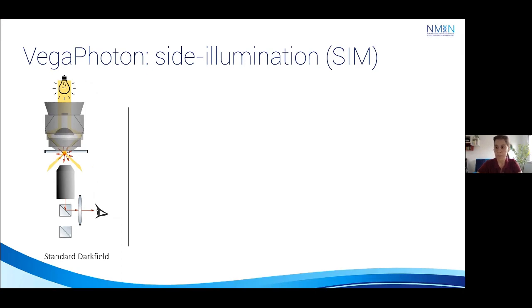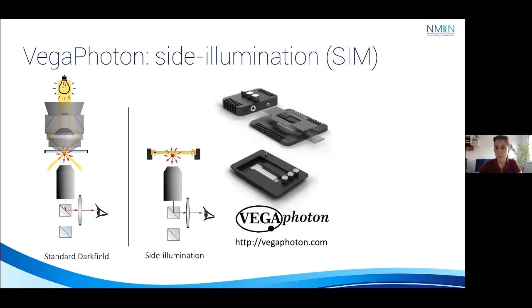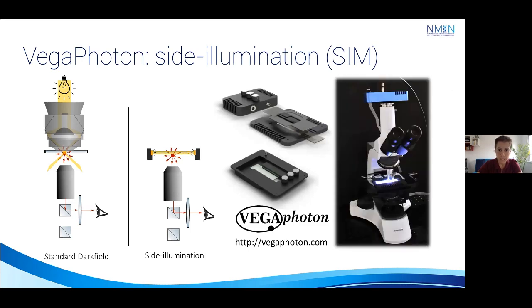That's why we developed a simplified dark field adapter in order to be able to see these nanoparticles on a simple pathology microscope for cells mounted on a microscope slide. And this is what we ended up with. Here you can see a prototype of this adapter on a very simple standard microscope.